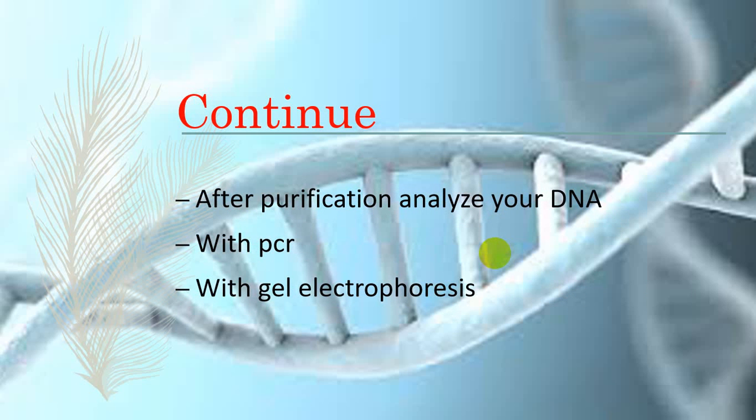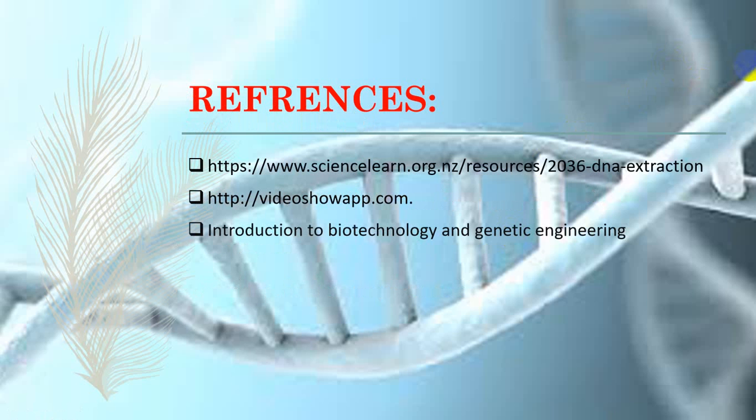After purification, analyze your DNA with PCR and gel electrophoresis. अगर आपने अपना DNA purify कर लिया है and you want to analyze it, then you can use PCR and gel electrophoresis. So PCR will produce multiple copies, and with gel electrophoresis we can fragment the DNA and find out different types of fragments which are present in the DNA. So it was all about our lecture.